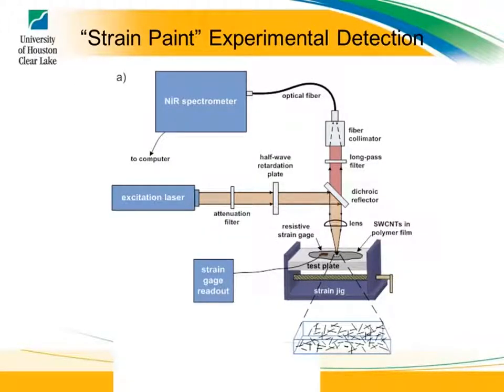And then I'd like to move on to a new material that we've got. You don't want all of the nanotubes aligned. You would rather have them mixed, but they have to be individual. If these nanotubes are touching each other, then you won't see any fluorescence. You can't detect the nanotubes. Then you have to use something like Raman spectroscopy or something else, which has some problems. The fluorescence spectroscopy is really easy as long as they're separate.